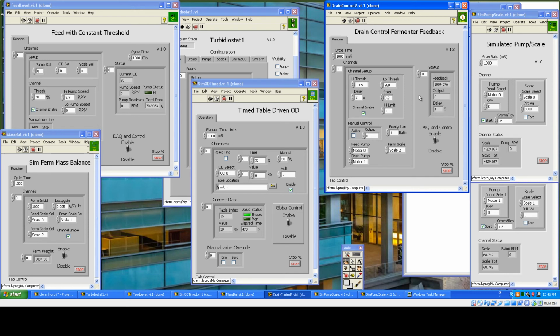And then what will eventually happen is once the OD sensor data ends, it'll go to 0. And then we'll show that we regulate as well based on the small input from the fermenter mass balance. So here we're starting to pump again, and it's going to be doing the same thing. Speeds up until we see this number start coming back down again.